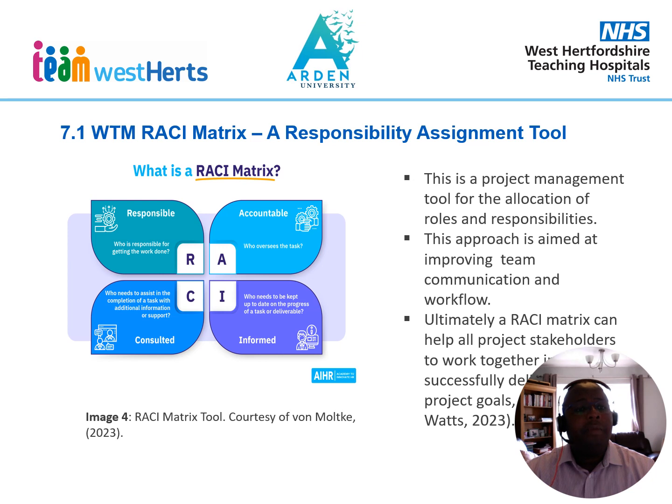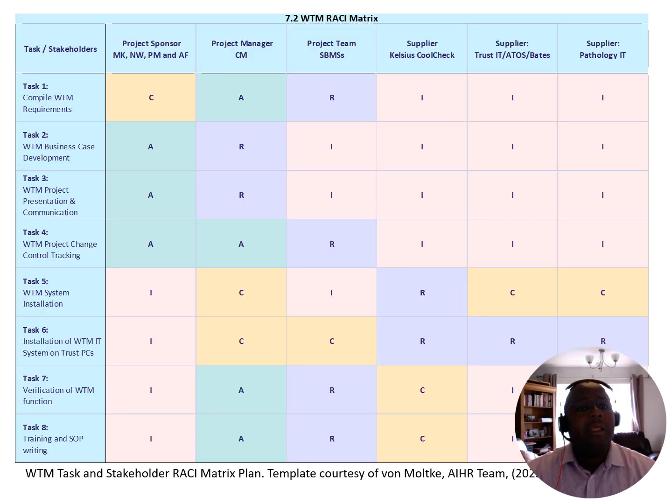So I used the RACI matrix, which is a responsibility assignment tool. The acronym RACI stands for responsible, accountable, informed, and consulted. So I used this tool to draw a RACI matrix for this electronic temperature monitoring project, and to identify who will be responsible, accountable, informed, and consulted among the stakeholders. So here is the wireless temperature monitoring RACI matrix.